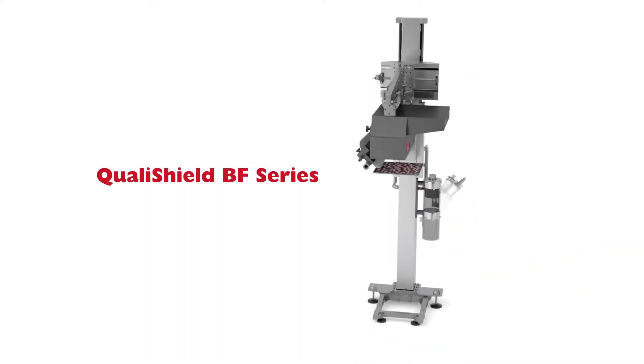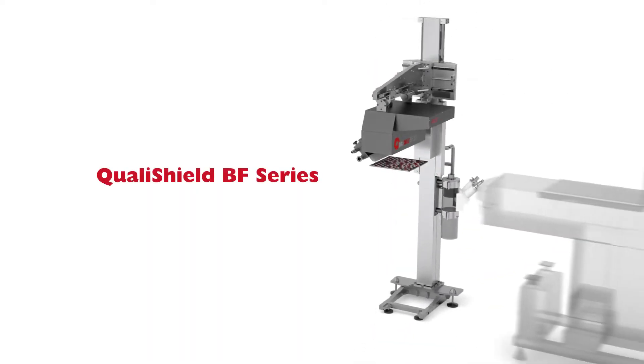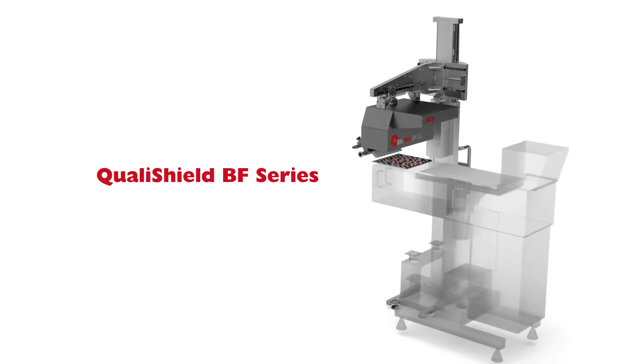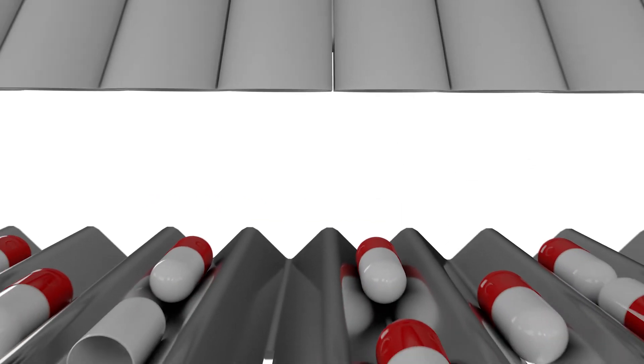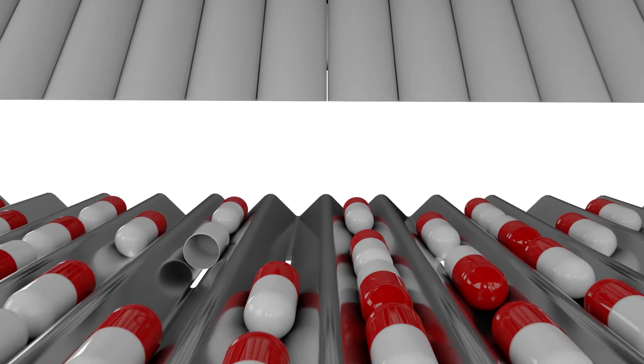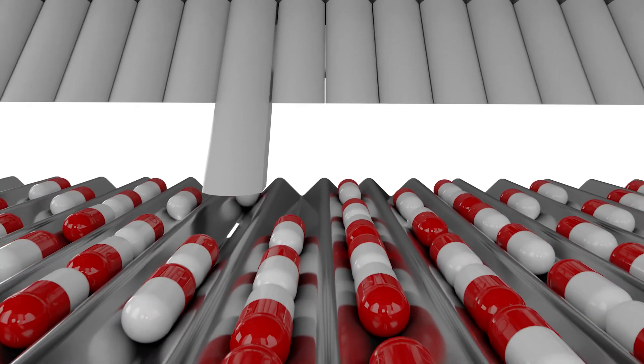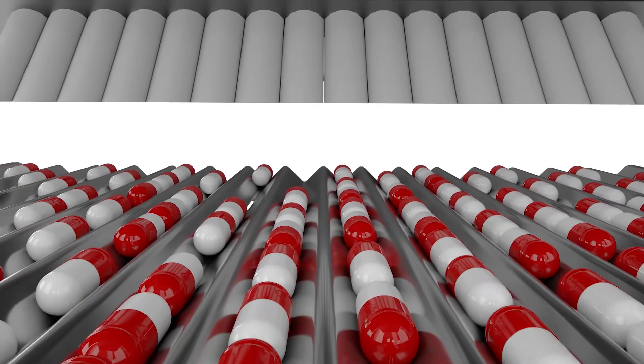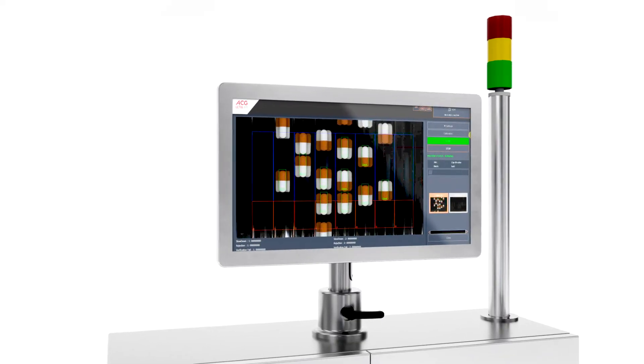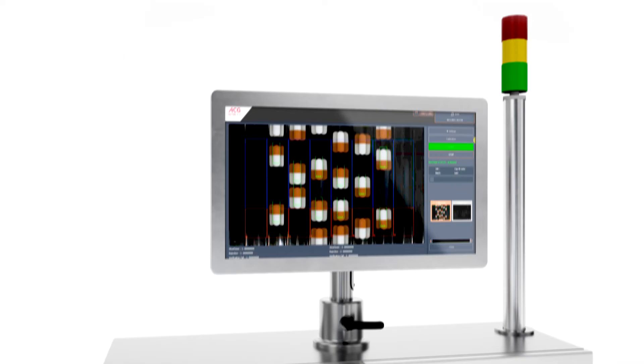Introducing ACG's QualiShield BF Series, an advanced bulk inspection system that not only spots and removes every imperfection but also verifies it, because sometimes you just need to check for yourself.